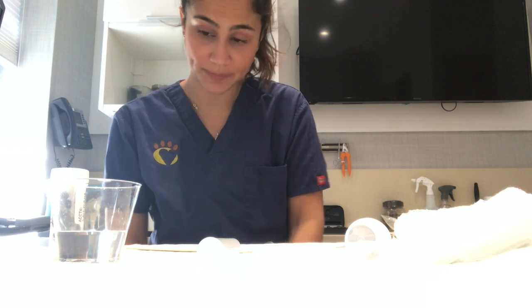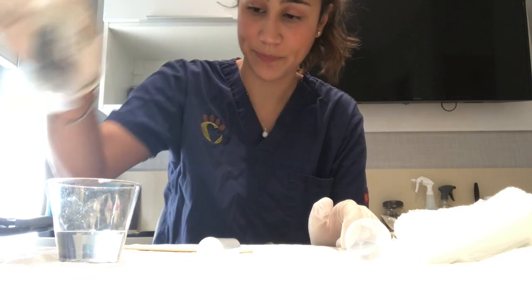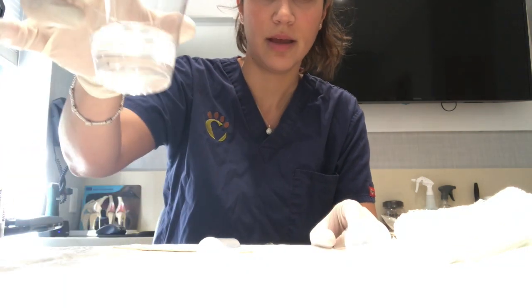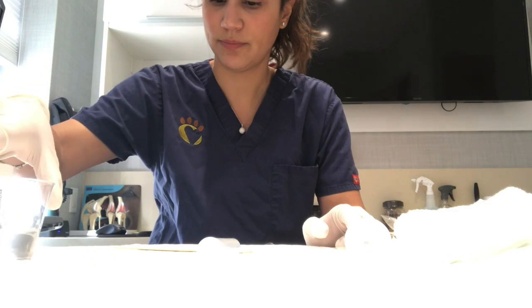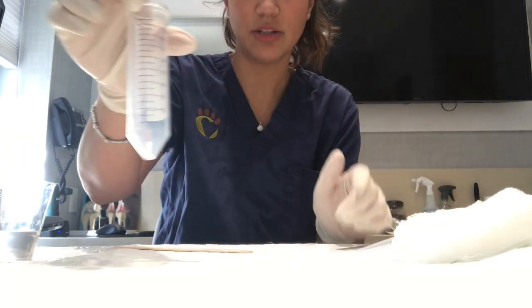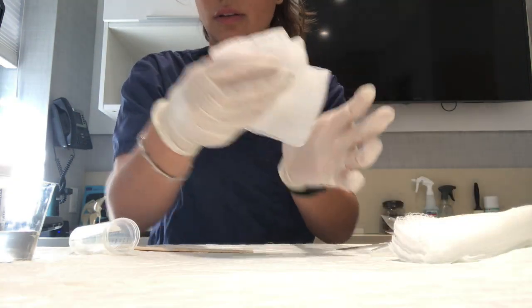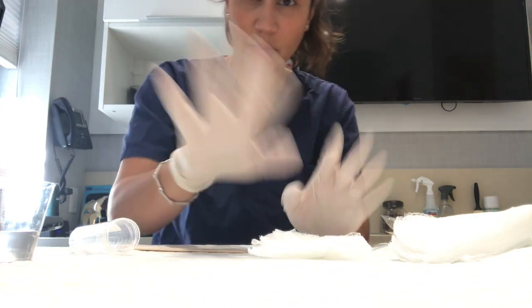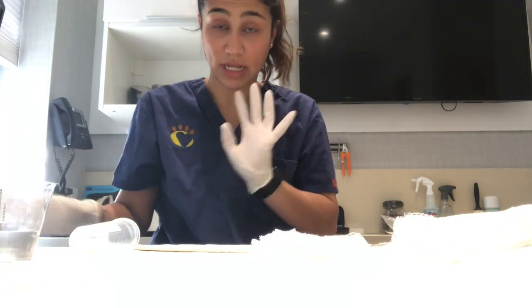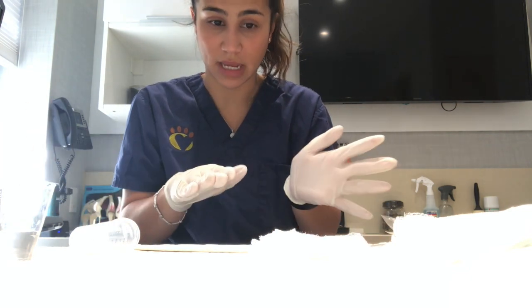Okay, so today I'm going to start with a simple fecal flotation. Right here, the objects I have are my stool sample, my Fecatech solution, my centrifuge tube, and some gauze squares. I'm also wearing gloves just to make sure that I don't get any fecal matter on my hands. If there is any sort of parasite in the stool sample, I want to make sure that I'm safe and I'm staying very clean.